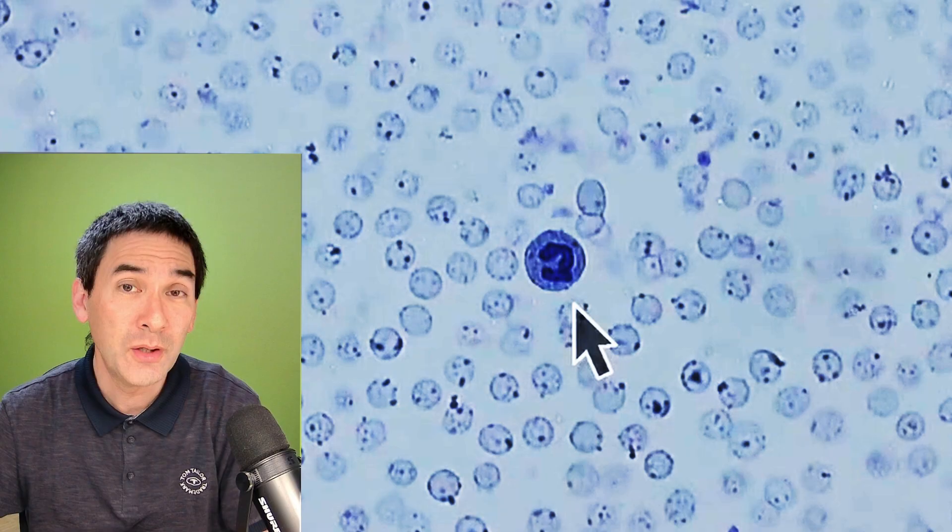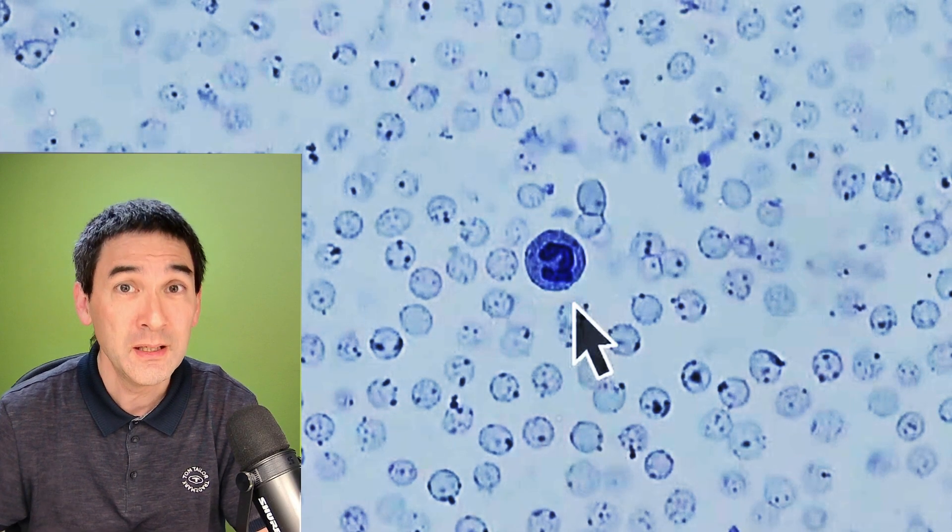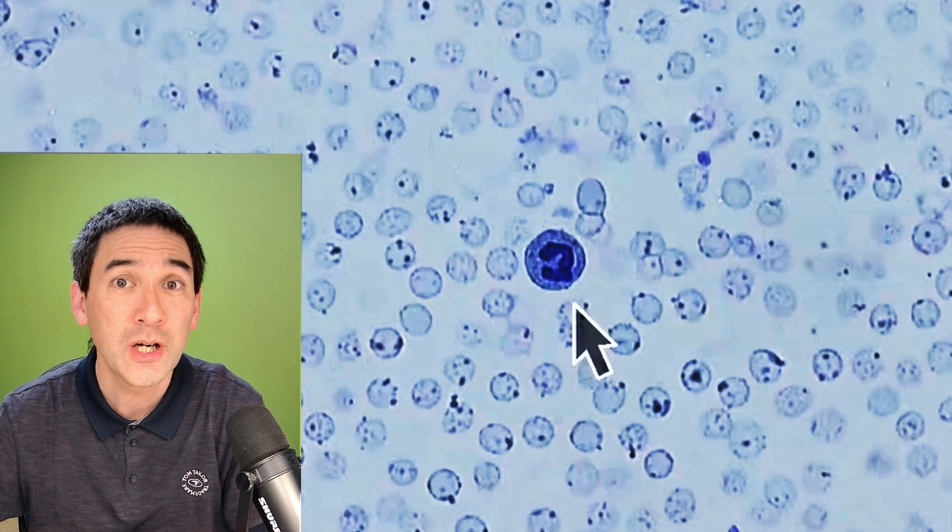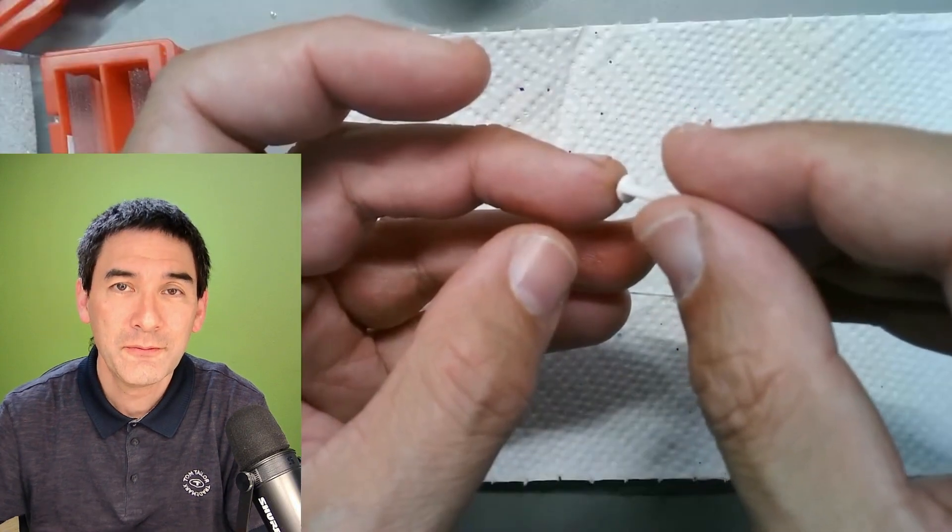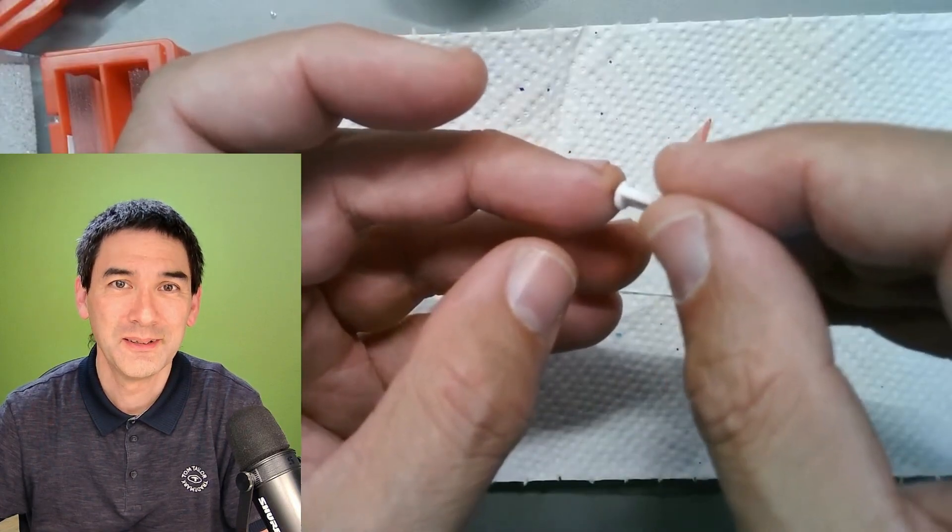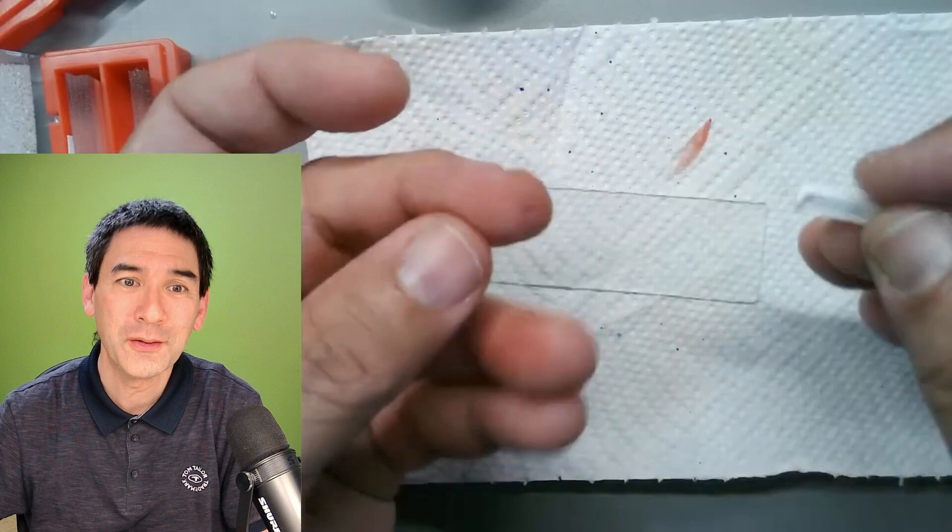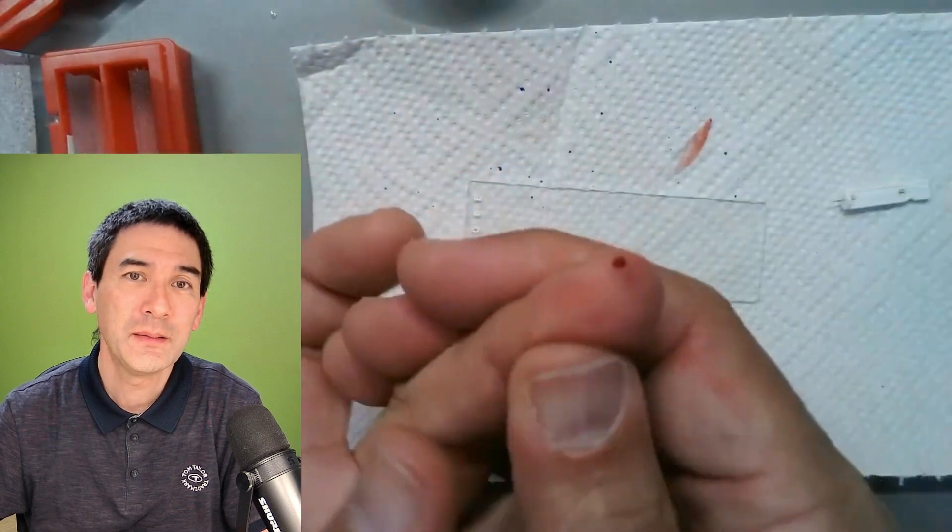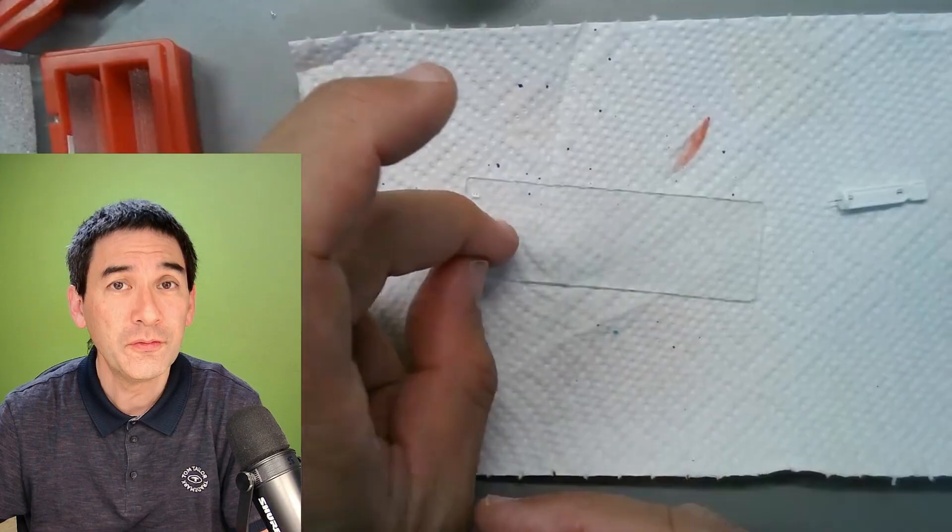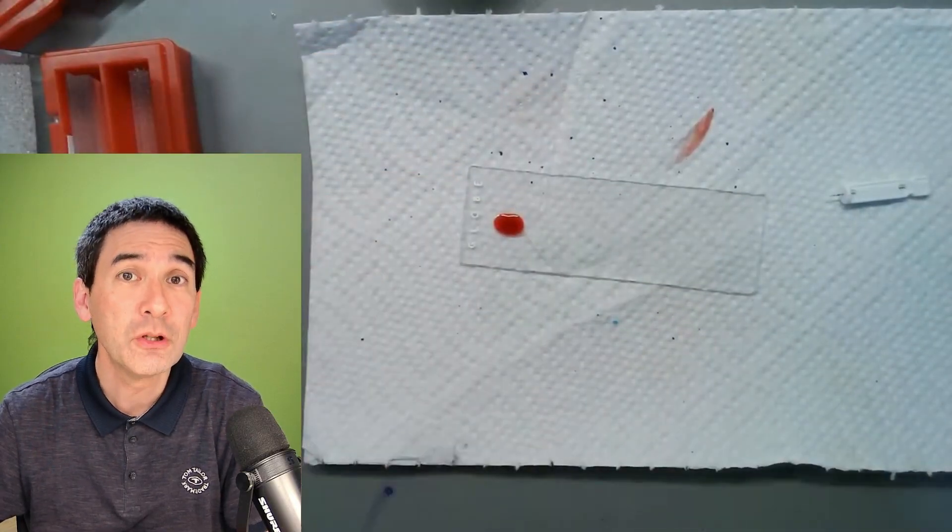Now I also want to show you a second way of actually observing blood and in this case we are going to use a large cover glass. Again I have to prick myself a little bit with the lancet and I'm trying to get a little bit more blood out in this case here and now I'm placing the drop of blood again on the side of the microscope slide and now I'm using a fairly large cover glass.